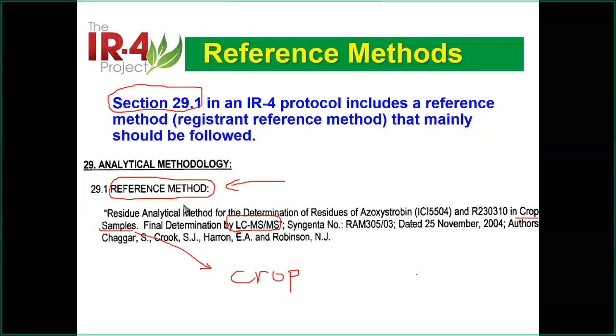The samples were sent to different labs. I think 3 labs. One is in the UK, one is in Ghana, one is in Kenya. So the 3 labs, each lab must do the validation themselves because you are a different lab. You are not exactly the same as this lab. So you have to validate it.